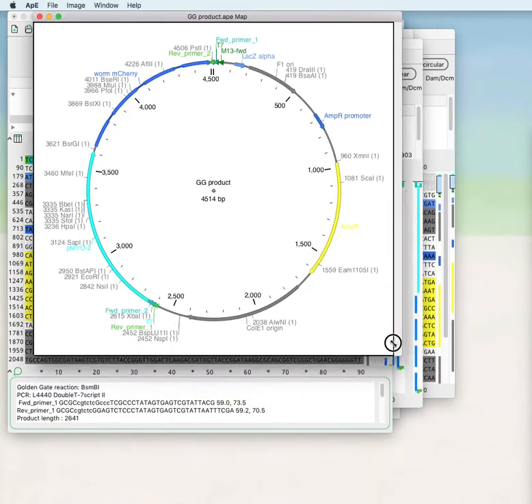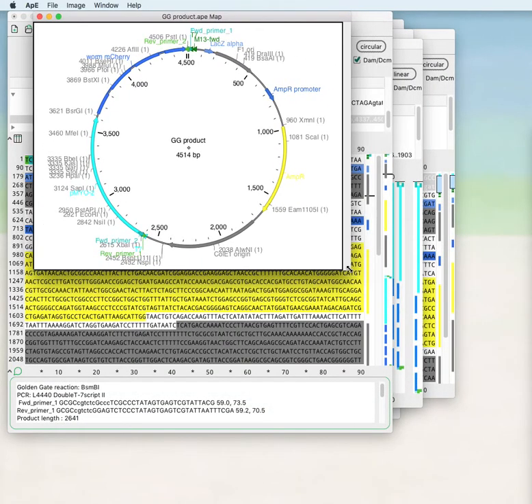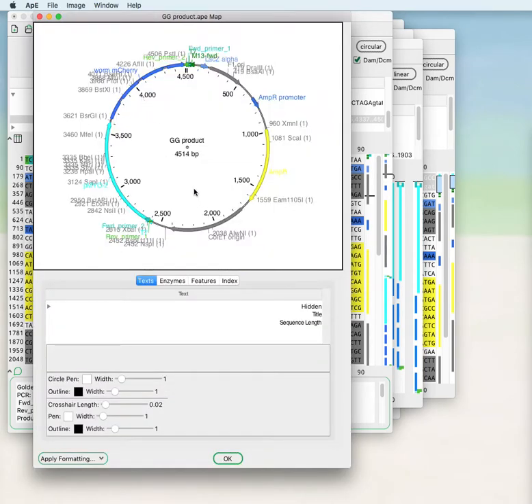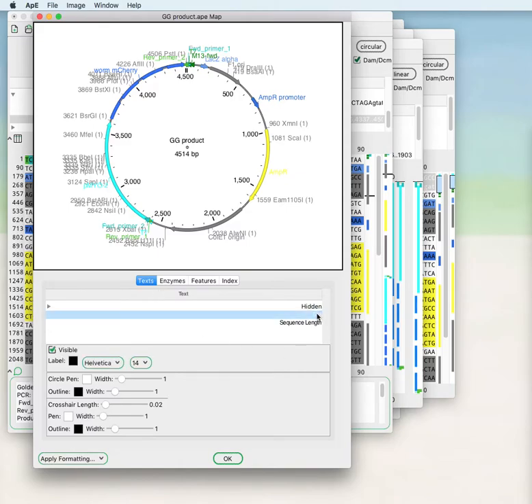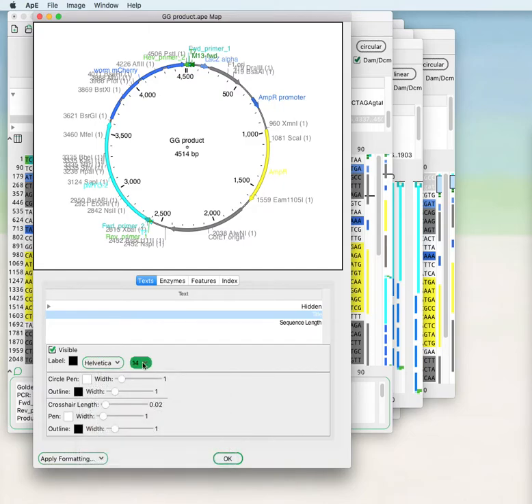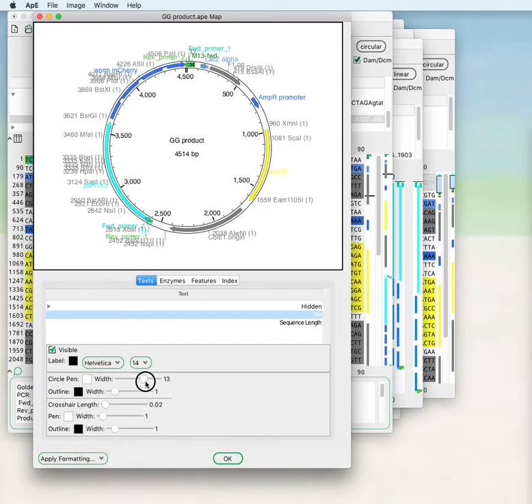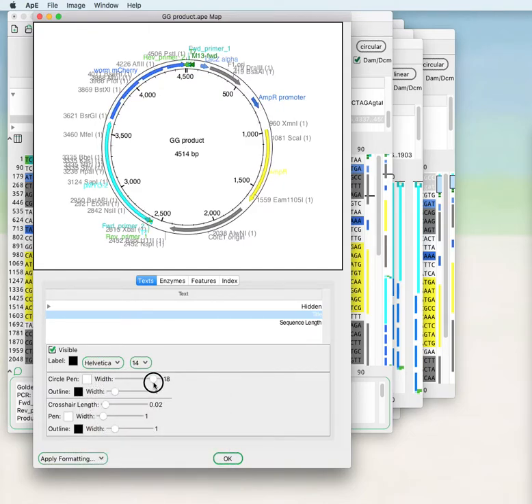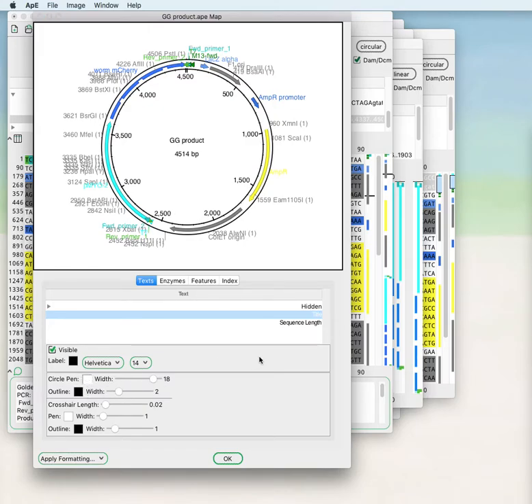Once you have the graphic map you can configure either by right-clicking anywhere within the window or clicking image configure. This will allow you to configure things like the font of the text, the font size, and the circle of the map.